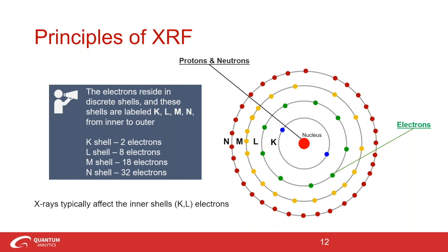Electrons are particles that orbit the nucleus at high speed and carry a negative charge, which balances the positive electrical charge of the protons in the nucleus. Since the total negative charge of the electrons is equal to the positive charge of the nucleus, an atom is neutral. The negative electrons are attracted to the positive protons, so electrons stay around the nucleus in discrete shells.